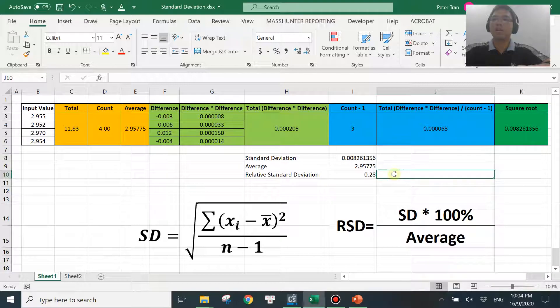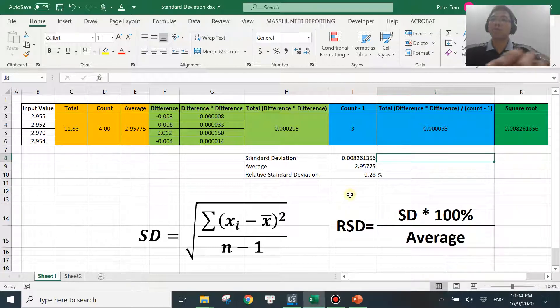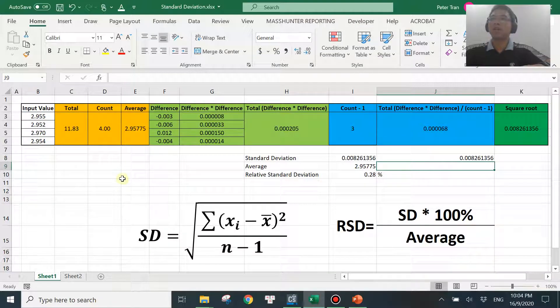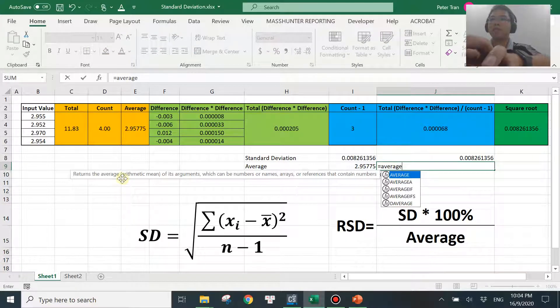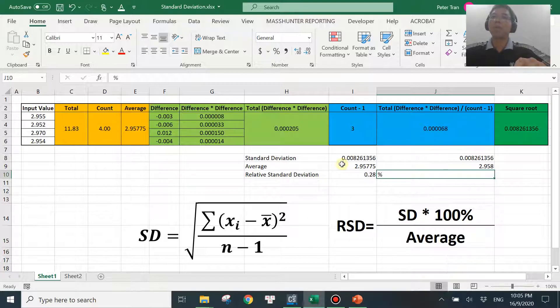That's how we perform the calculation manually. But if you know Excel, there's a quick formula: STDEV — which stands for standard deviation — and you just drag to select the numbers you want to calculate. Both ways give you the same numbers. But I prefer to know how the manual calculation is done, because that will be very useful when configuring intelligent reporting if I need to perform any of these calculations. To me, manual calculation is king.